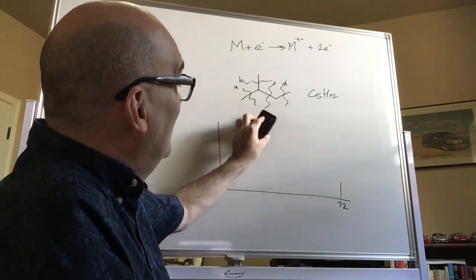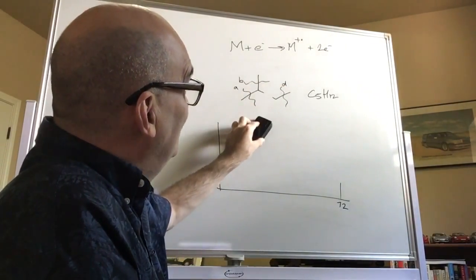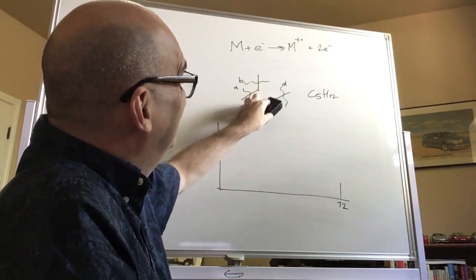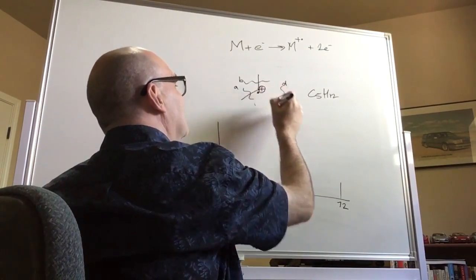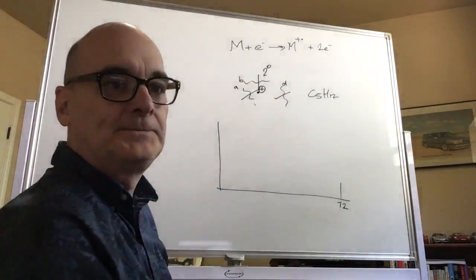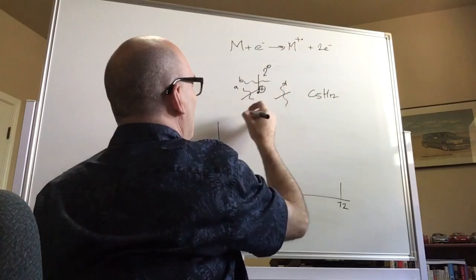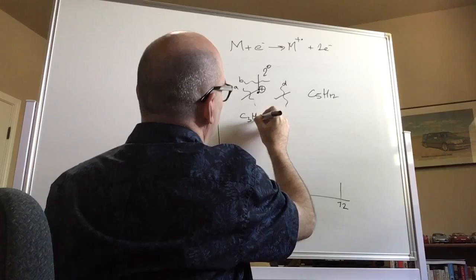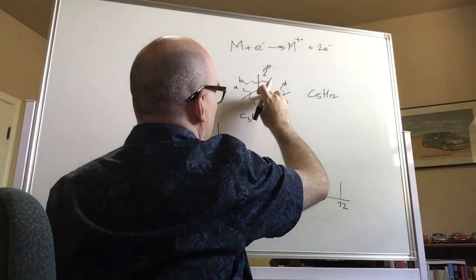C. If I take the path to break the bond that I've labeled as C, I get two fragments. This is a secondary carbocation. That's the one I'm going to take. So this was a C3H. What am I looking at? 1, 2, 3, 4, 5, 6, 7.